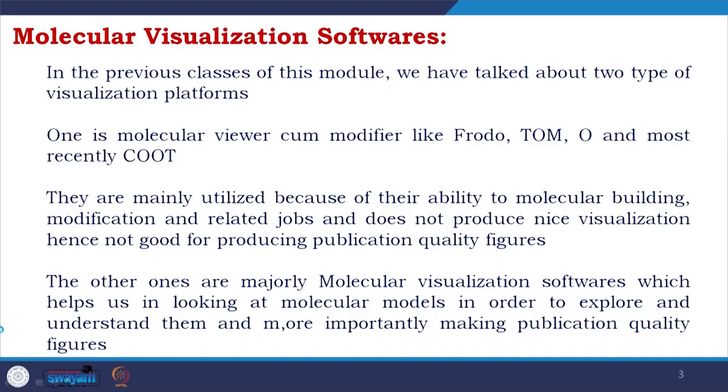So, if we talk about molecular visualization softwares, as I told in the previous classes of this module, we have talked continuously about two types of visualization platform. One is molecular viewer cum modifier, like Frodo, TOM, O, and most recently COOT, which I talked about in detail and demonstrated.